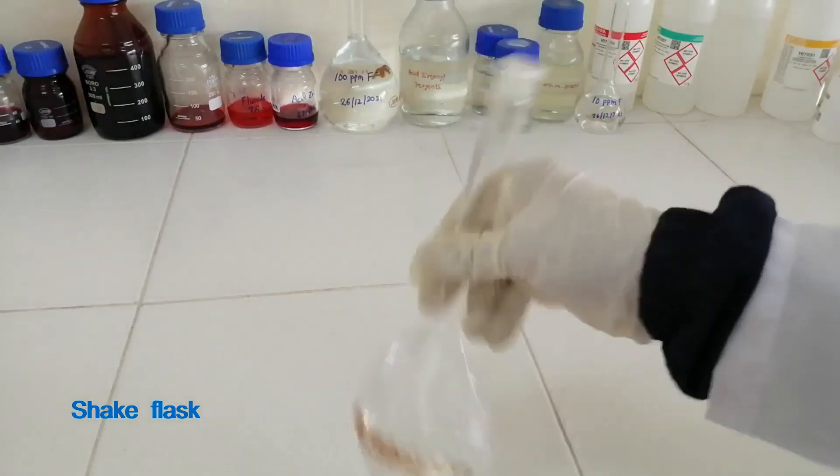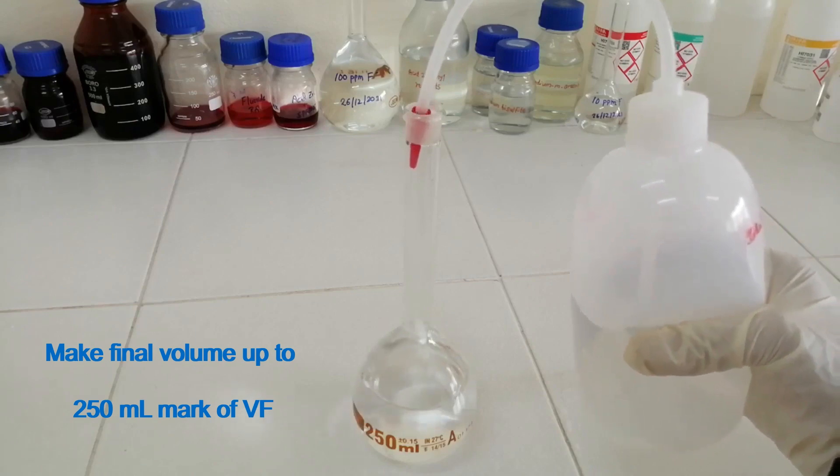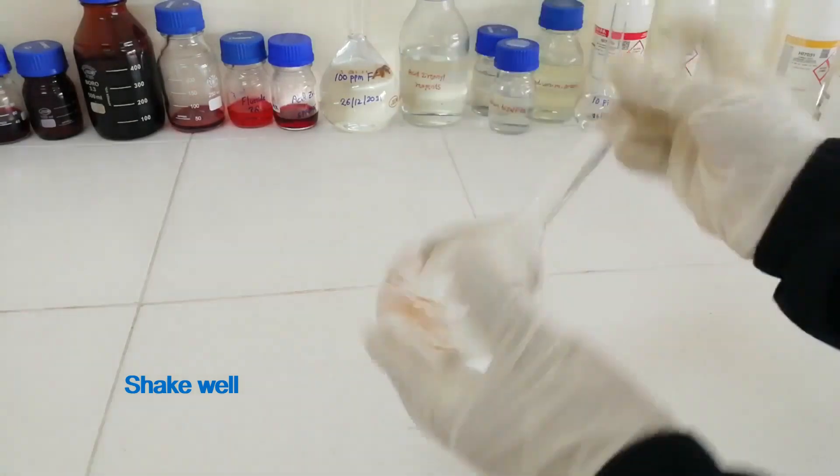Shake the flask. Make the final volume up to the 250 ml mark of the volumetric flask. Shake well.